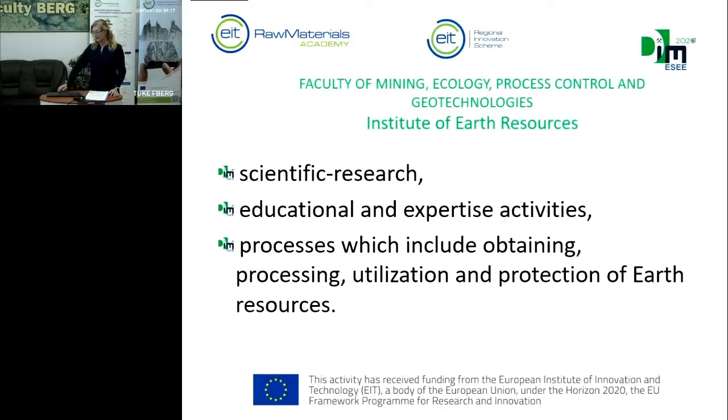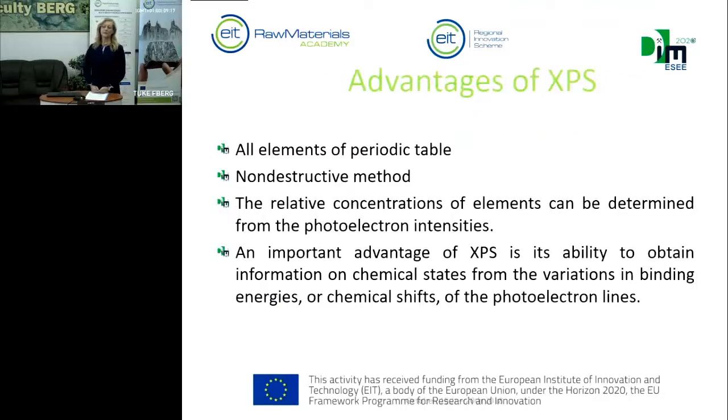Because I am a chemist, the main subject of my scientific research is preparation and characterization of new environmental materials, waste materials or raw materials by this XPS method. Why is it nice to have this device for the surface analysis?